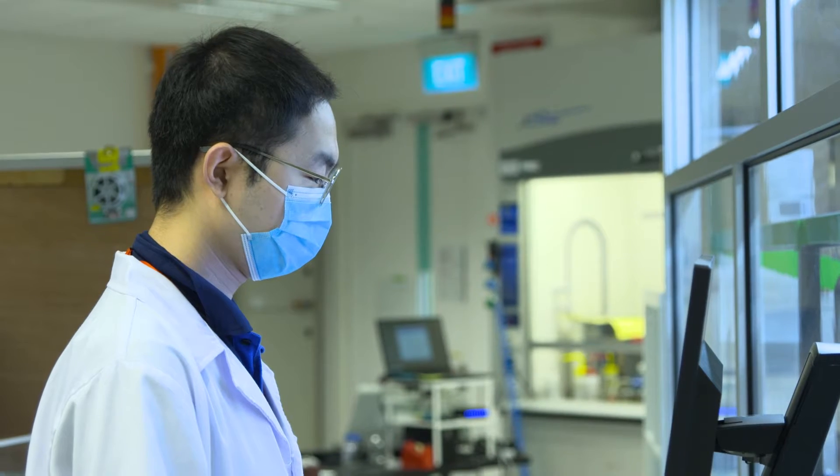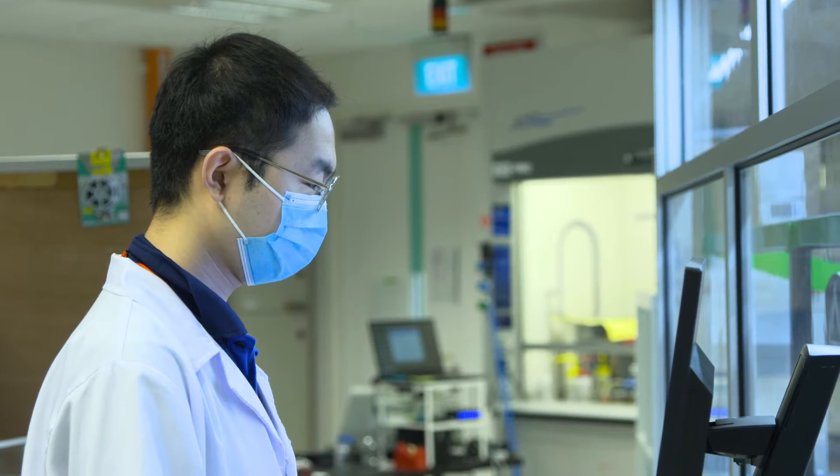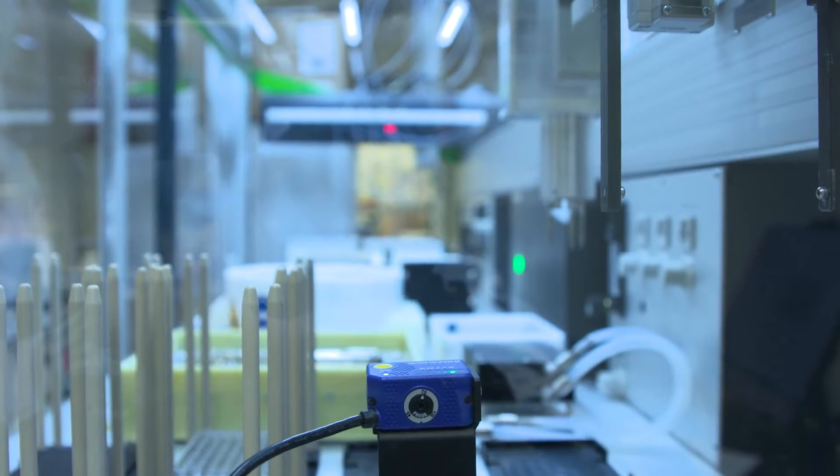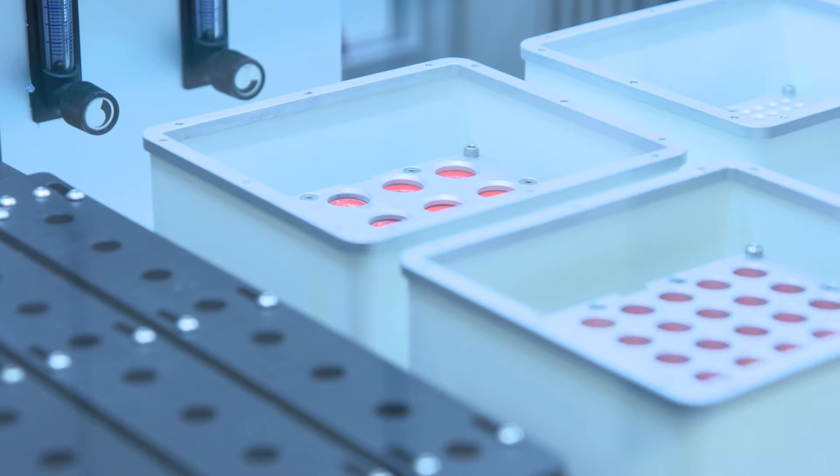In the past year we have spent quite a bit of effort building this high-throughput automated synthesis system to make solution and thin film samples and we want to use AI machine learning to help accelerate the development of these material systems.